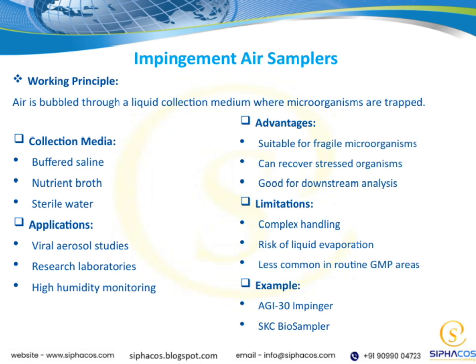And how does it work? The working principle is quite straightforward. Air is bubbled through a liquid collection medium, and microorganisms are trapped in that liquid. This bubbling action effectively captures the microbes, making it a practical approach for various sampling needs.